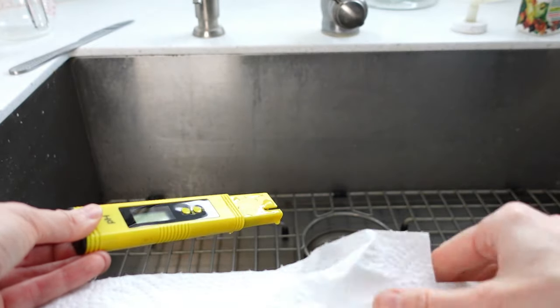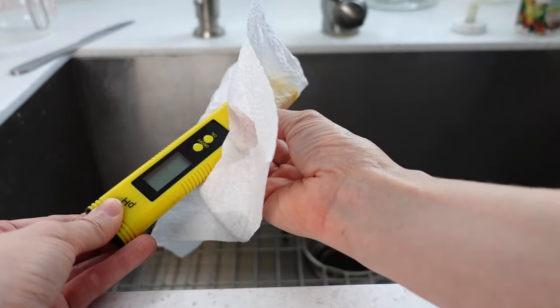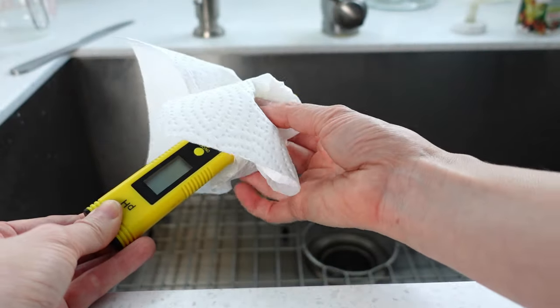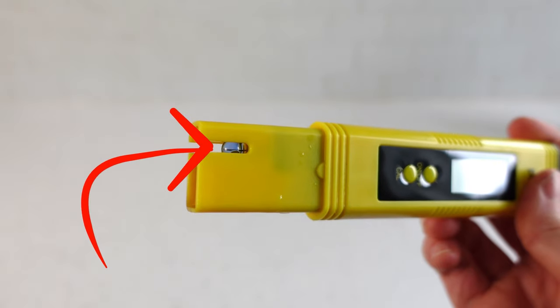Rinse the meter off with a little distilled water. Wipe off the excess water and be extremely gentle with a feather-light touch. Be absolutely sure not to touch the internal mechanism, particularly the little glass bulb.